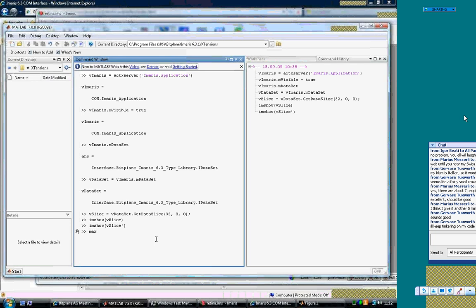So we subtract our values from the maximum of all values. So we get our maximum value, which is the maximum of all values. Using this notation, we convert the 3-dimensional array to a 1-dimensional one, and because the maximum function returns the maximum of each column, in this way we have only one column, and we will have only one value.